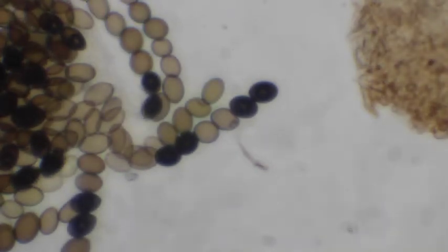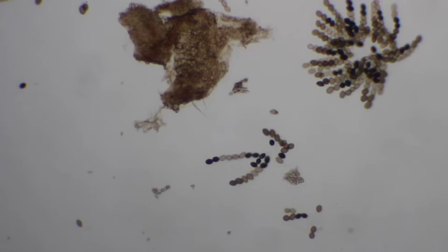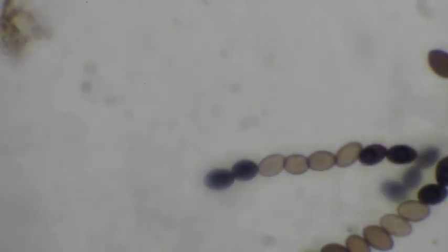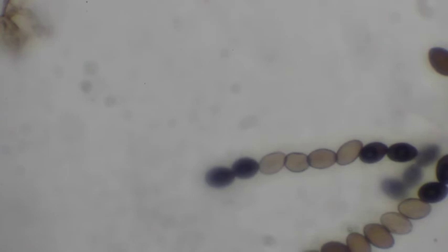Good 8 spores. Here's another nice one. I'm focusing on that guy. Okay, the one below it doesn't quite look mature, but that one is mature with very good color.